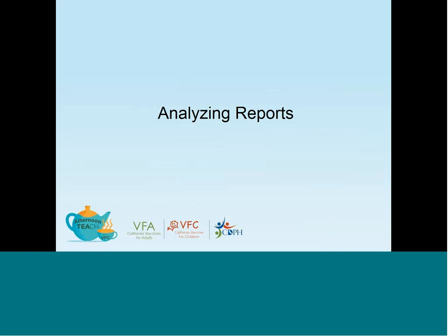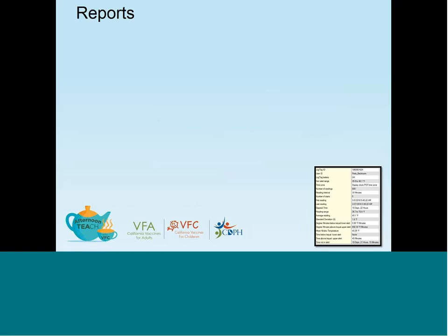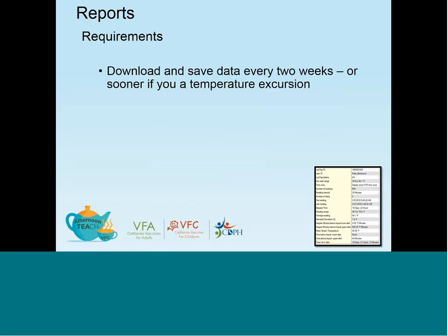Analyzing reports can be a challenge for some. Now let's spend some time discussing how to analyze reports generated from your digital data logger. Downloading and saving temperature data reports or files is a requirement, which might explain why we constantly say to staff that you should become very familiar with the different reports and the functionality of your particular data logger.